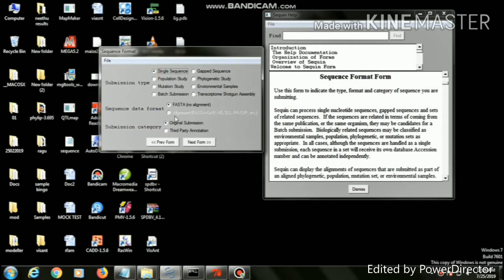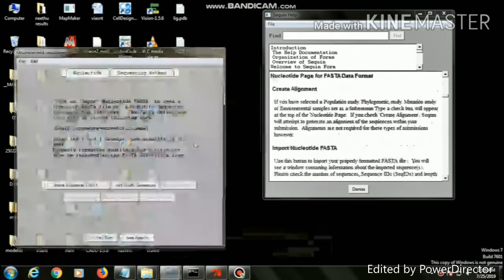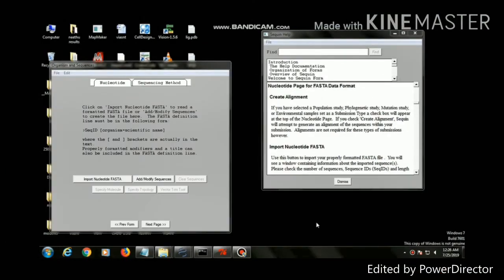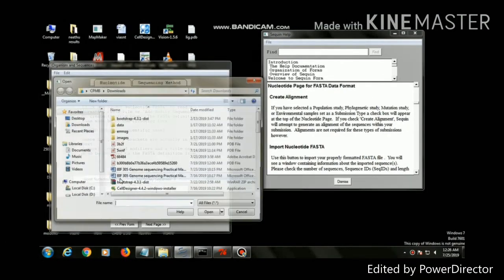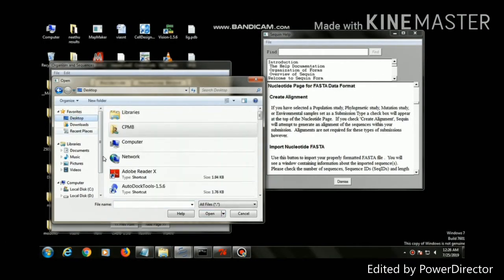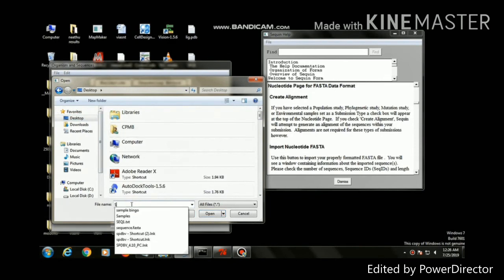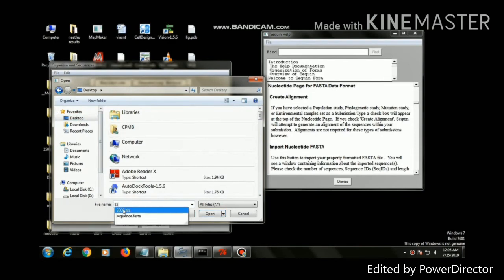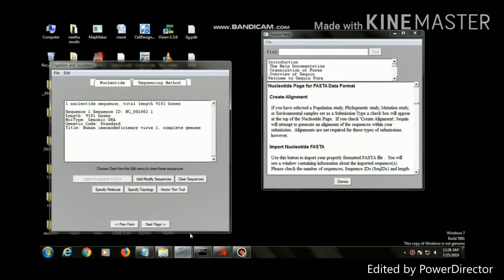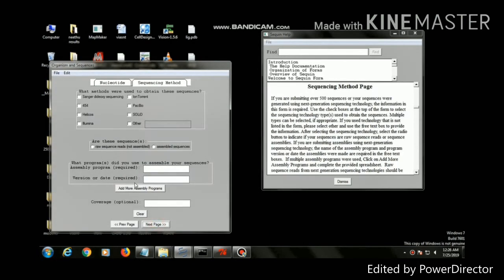The next form is the sequence format form. Click next page. Then import the nucleotide FASTA form sequence from the desktop. The file should be in text format. Click next page.